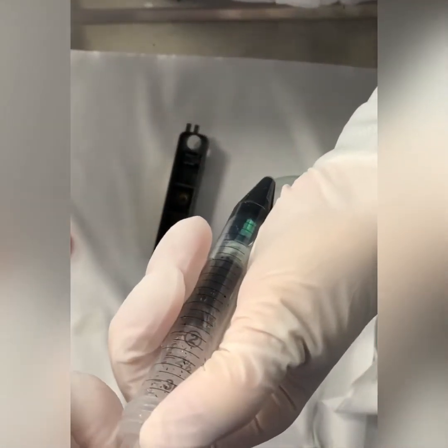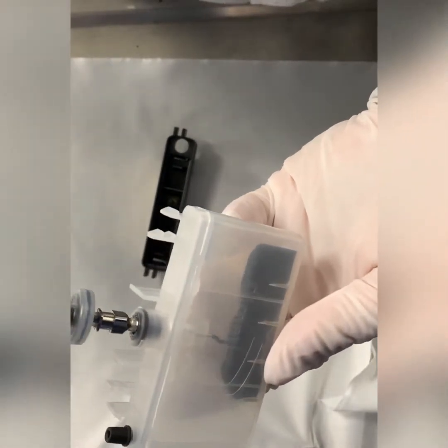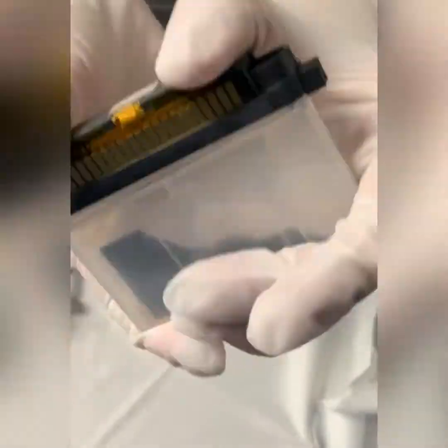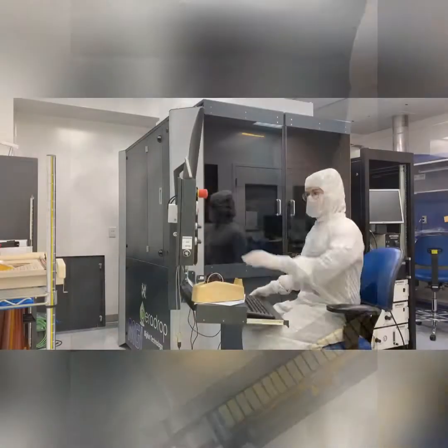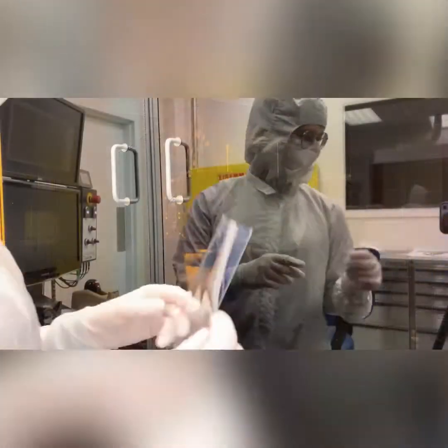Before putting the solution in the ink cartridge, it is important to filter this solution to make sure not to clog the nozzles. I print all my sensors for my project with the inkjet printer here at HIENO, and I print everything on a flexible substrate that I have previously washed and plasma treated.